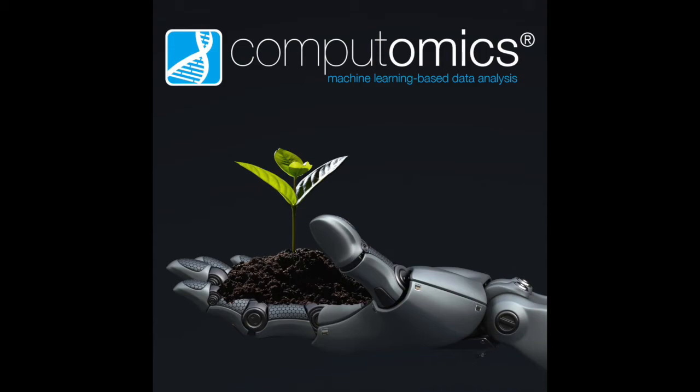And then maybe another client who would want to interact with Morpheus could be a DNA sequencing provider who wants to offer a set of analyses to their customers for metagenomics and make this more accessible. In that case, the sequence provider could send the FASTQ files straight to the Morpheus service, and the Morpheus service would then do data analysis and storage, and you could send a link to your customer so the customer can download the data and interact with the data through Morpheus.